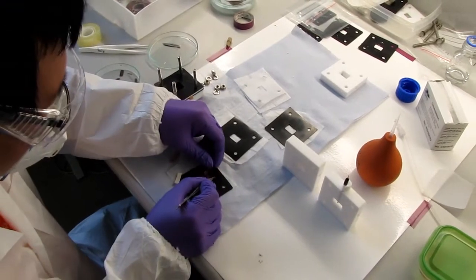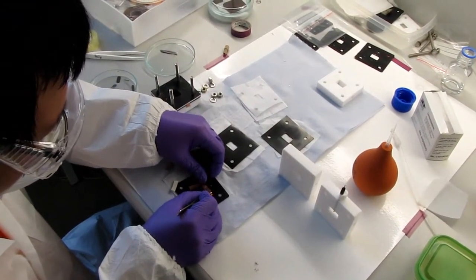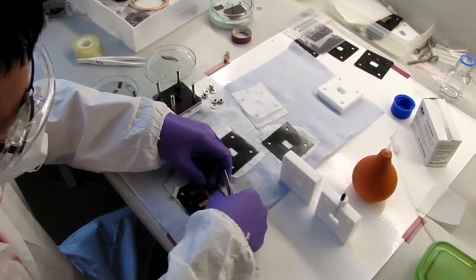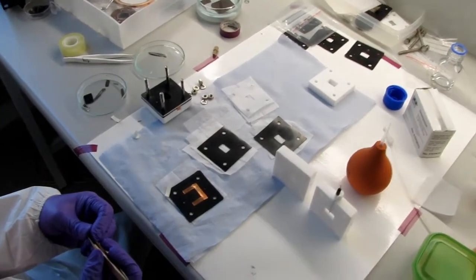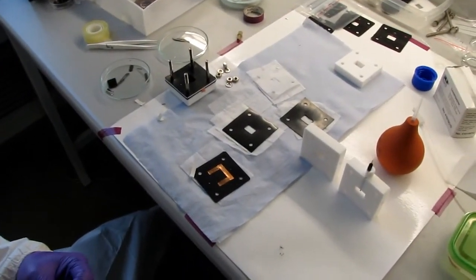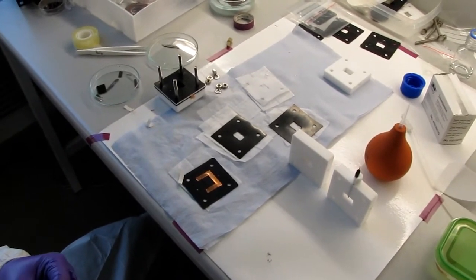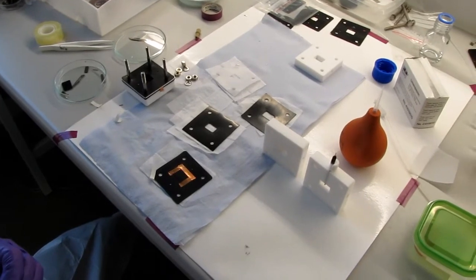In this case, because you have a very thick layer of electrolyte, which will consume a lot of voltage and electricity. What electrolytes are you using? I use potassium bicarbonate. I also can use KOH, but for safety reasons, for this kind of experiment I use bicarbonate.